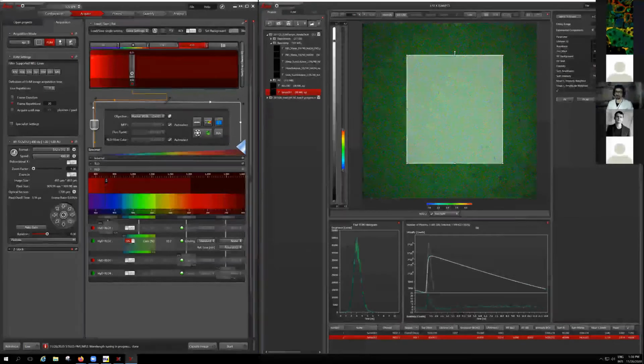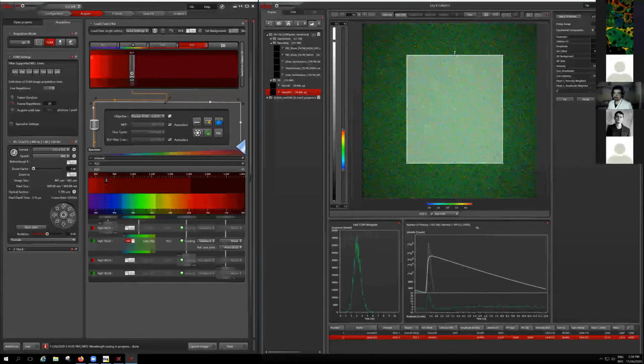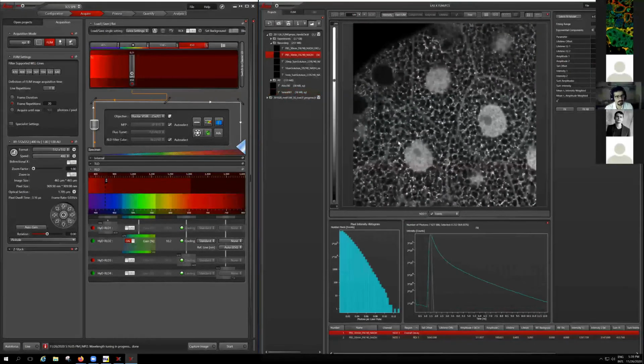If you don't know your sample, you don't know how many components it has, you go with 1 and then you see a terrible residual. Okay, let me show you. I was showing one data set, and here is the decay curve, and I fit it with one component.